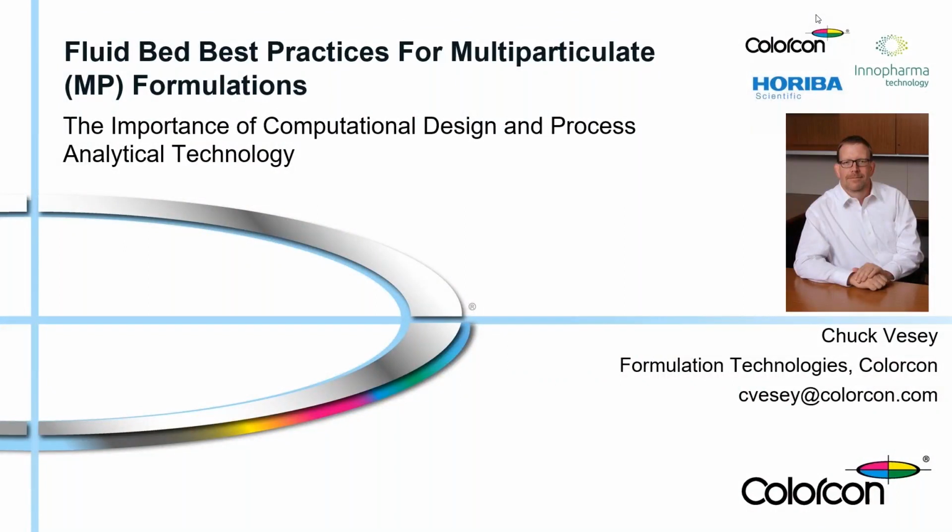Modulating drug release characteristics has traditionally focused on coating thickness to achieve a target release profile. Typically, the quantity of the coating is determined by increasing the percent weight gain until a desired release profile is obtained. This often is a very time-consuming process that does not offer the process control necessary to satisfy increasingly important quality initiatives.